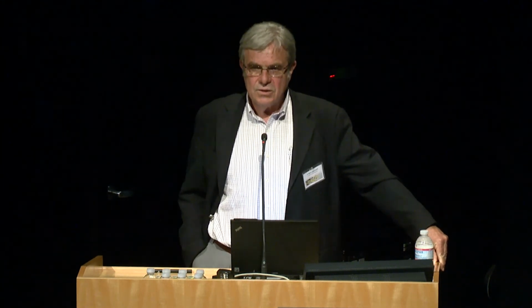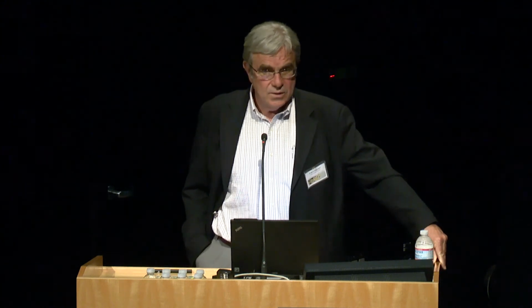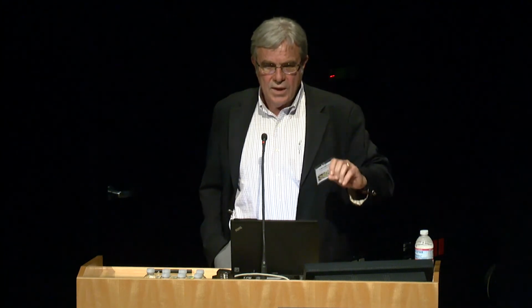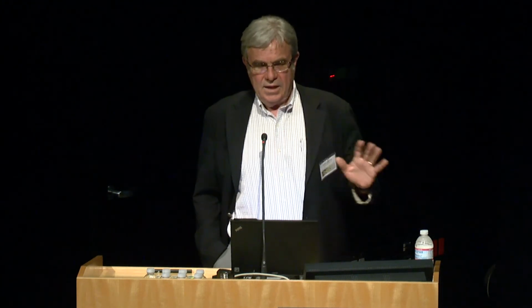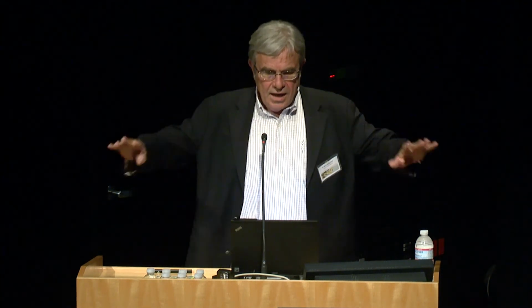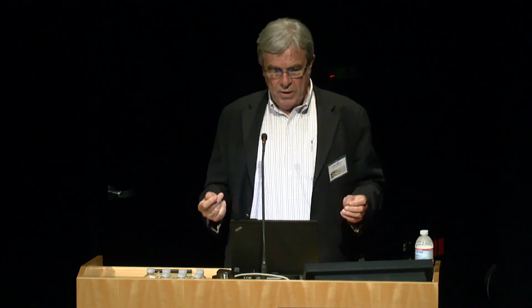Well, I've shown you we can measure norepinephrine. I didn't show you in freely moving animals, but we can do that. So we did exactly the same experiment with norepinephrine neurons and asked the question, do you fire during intracranial self-stimulation? And you've never seen such stable, flat responses in your life. Nothing from norepinephrine until we did the following experiment.